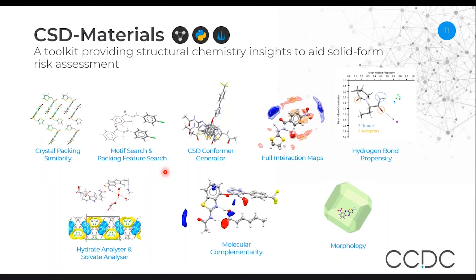There is a motif search and packing feature search. This allows you to define three-dimensional arrangements of atoms or molecules and then search for that particular three-dimensional arrangement. We see here that this stacking of rings with chlorine atoms has been defined, and you can search for other structures which contain this particular stacked set of fragments.